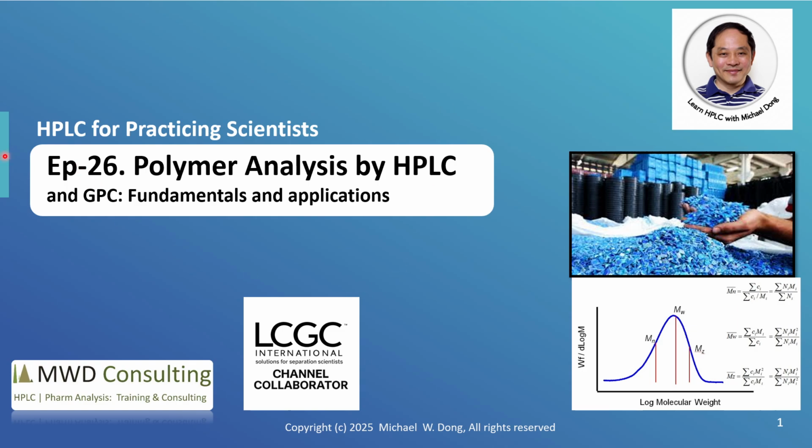Good morning. This is Michael Dong on video episode number 26 on polymer analysis by HPLC and also GPC, standing for gel permeation chromatography.